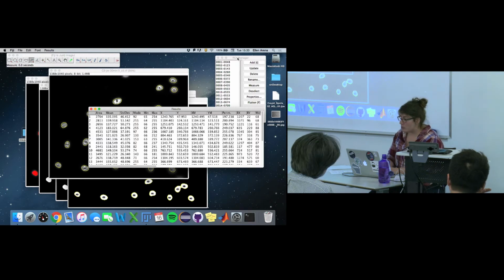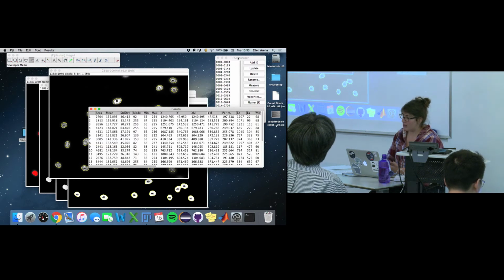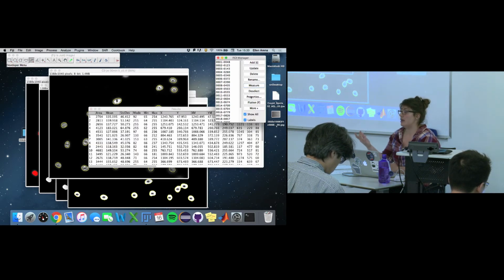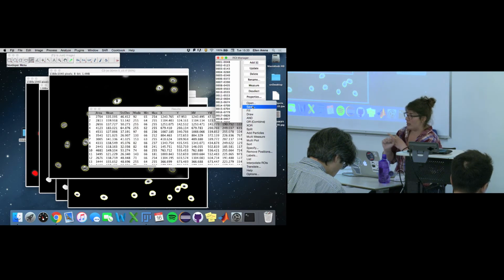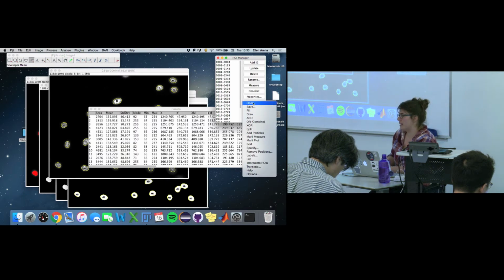So you can actually save your ROIs. In this More option, you can save a zip file of your ROIs. I always do that when I'm working with my sets. I always save the original data set, the binary mask that I create, as well as a zip file of my ROIs, so I can always go back. You can open that zip file directly here in the ROI manager, and then overlay them on your original data sets, just to ensure that everything's lining up.